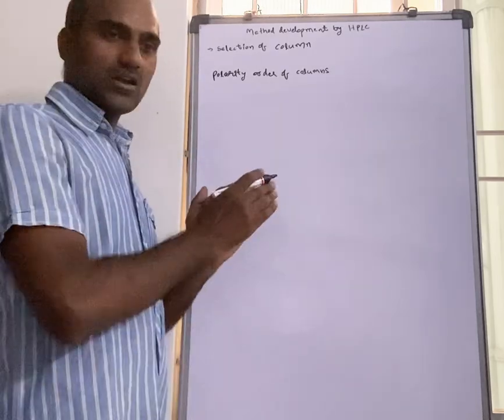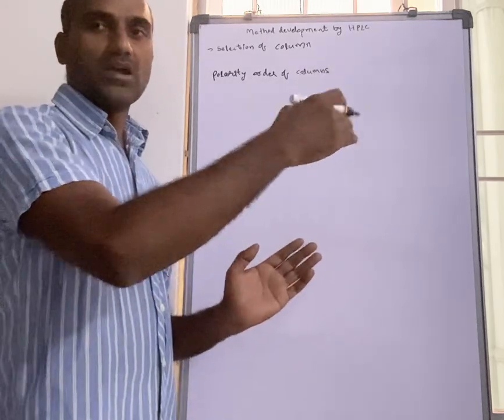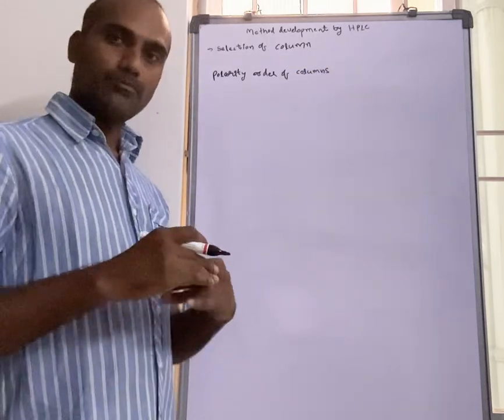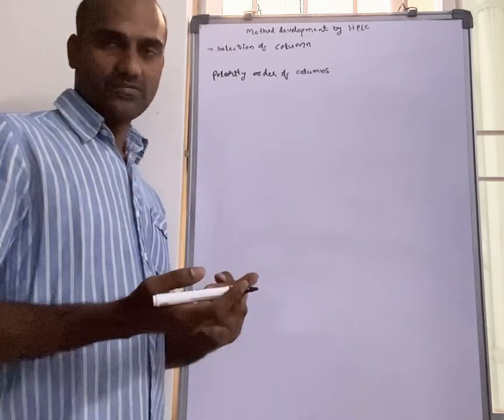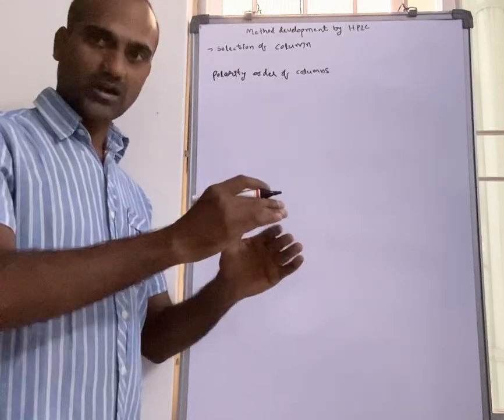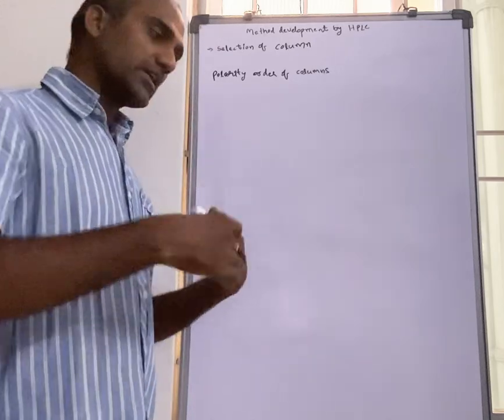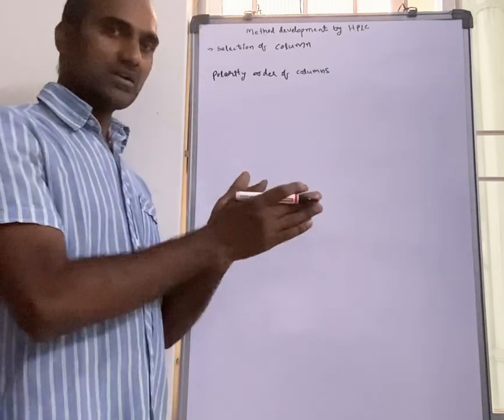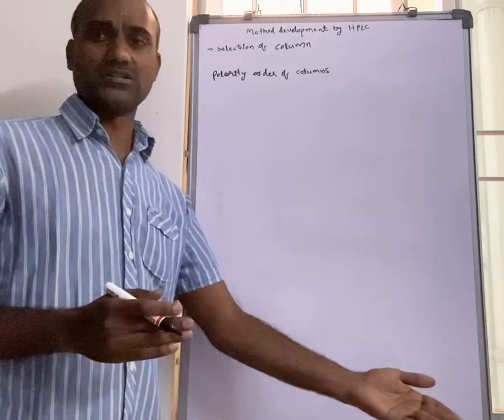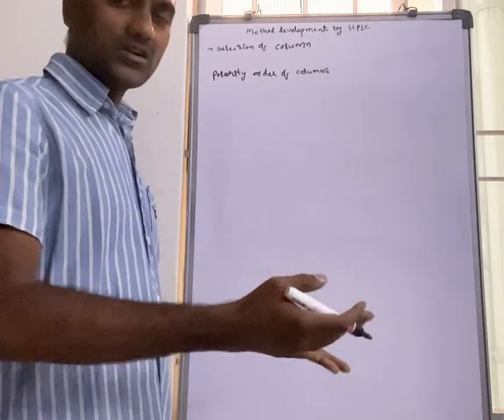First select which column will be for that molecule: C18, C8 or C4, cyano, phenyl or anything. Based on the polarity of the molecule, you select a stationary phase of similar polarity. Then if you selected C18, select any one C18 brand. If it is not separated, then go for another brand, because there will be slight differences from one brand of the same column to a different brand. What are the differences? Now I will tell.